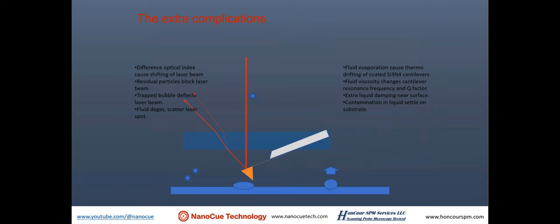The atomic force microscope, compared to the other high resolution instruments, has one unique feature, which is it could image a sample while the sample is positioned inside a liquid. There's one thing I wanted to mention is that people who are not experienced in AFM imaging were thinking you could image a molecule while the molecule is in liquid. This is not exactly accurate.